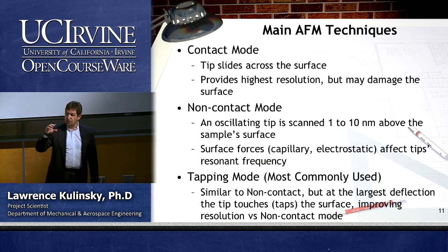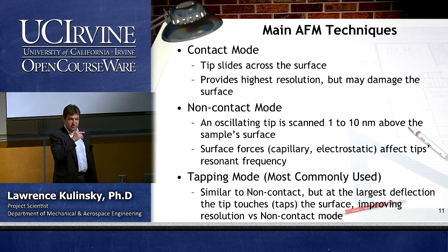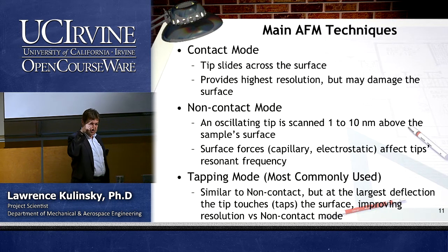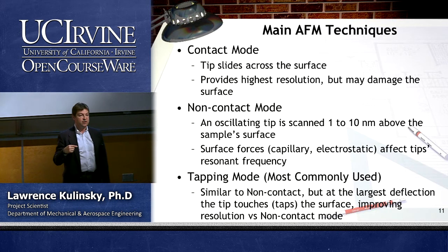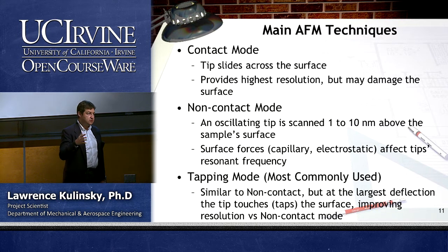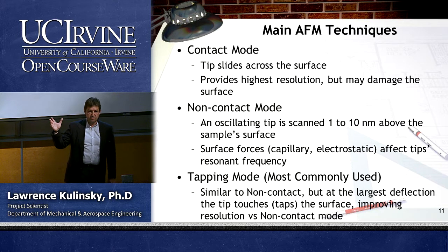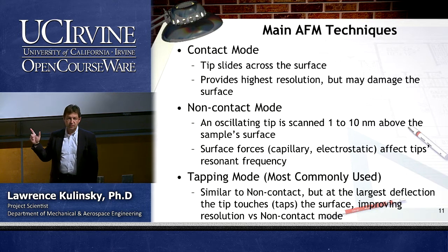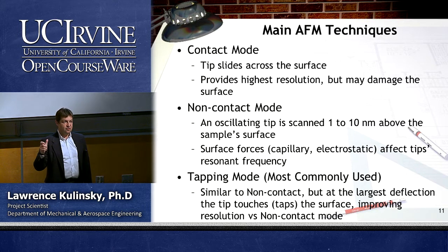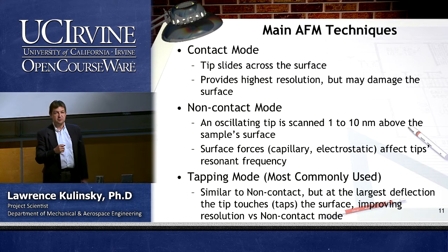As the resonant frequency changes, well, you can observe that, right? Because you have this laser shining on the tip. So you know what the frequency is, and you can deduce features of the surface. Actually, this is what's called vibration mode AFM. And we have Professor Kumar Vikramasinghe on our campus who participated in inventing that mode of AFM microscopy at IBM.